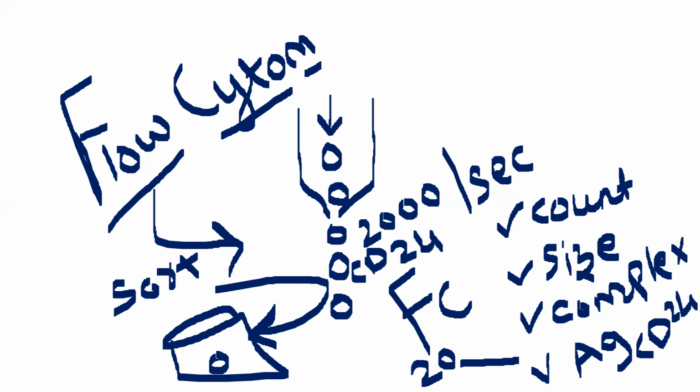Out of these 120 million sperms in 1 ml of semen, I want only that one particular sperm which has the capability. That can be identified, filtered, sorted, and utilized for IVF, in vitro fertilization. So just imagine the potential applications of flow cytometry. It can sort the cells.